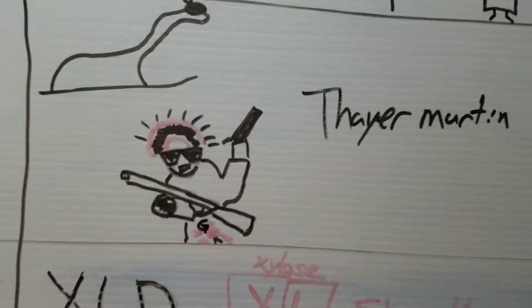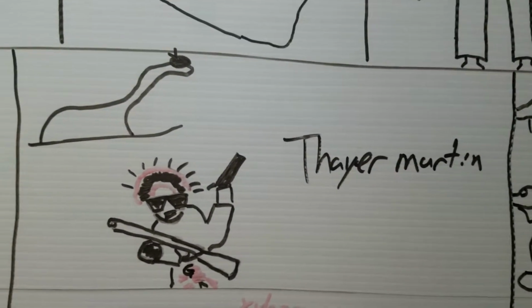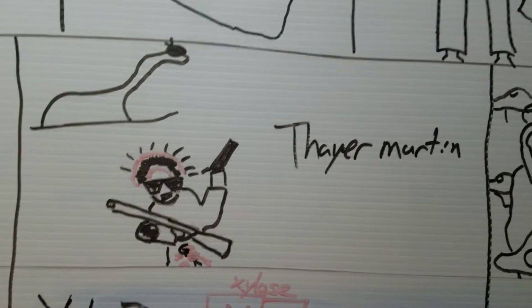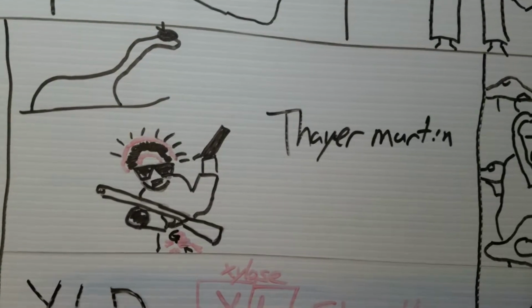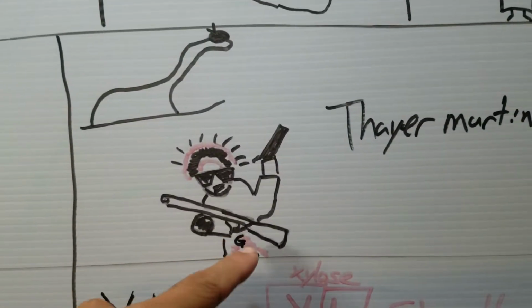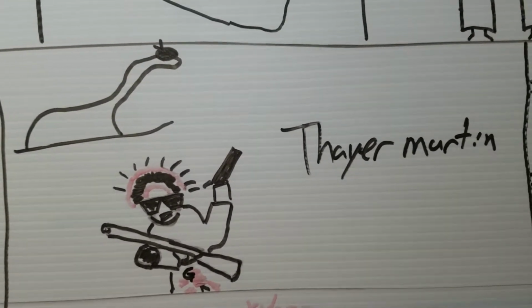So here we have Thayer-Martin, and we can see that his head, right, there's some red stuff around it. We see in his crotch area there's some red stuff around it. Okay, the diseases that this tests for, it tests for meningitis and it tests for gonorrhea. So if you think about it, Thayer-Martin, this crazy guy running around, this Kim Jong-il looking guy, he got himself some STDs from just basically being a bad guy, and he also has meningitis. To help you remember, it's gonorrhea and not a yeast infection, all right? He has a belt buckle that has a G, and it's kind of like falling off and covering his crotch, so that just helps you remember it's gonorrhea, okay?